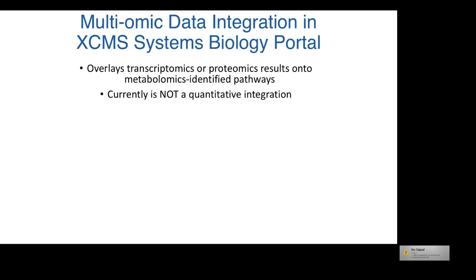And all of that information that I just told you about was only from the metabolomics data. Now we'll talk about how I've integrated transcriptomics data and used that to really address our hypothesis about branched-chain amino acid biosynthesis inhibition being the responsible pathway for the growth inhibition in our nitrate-reducing bacteria.